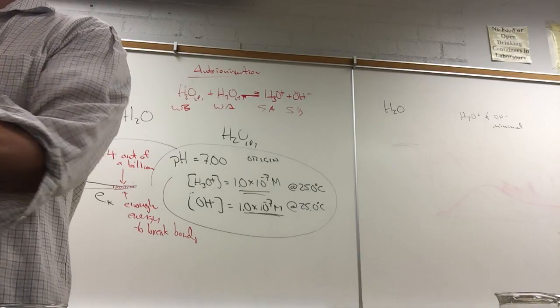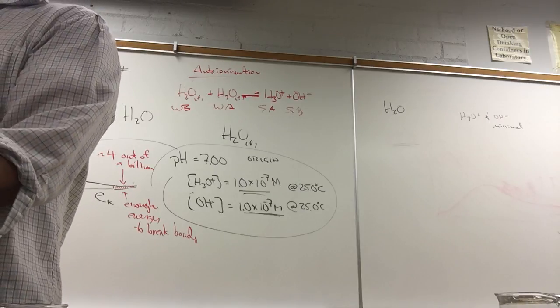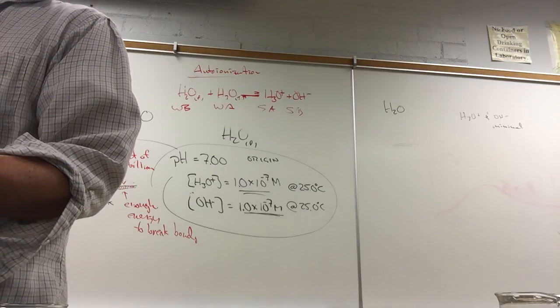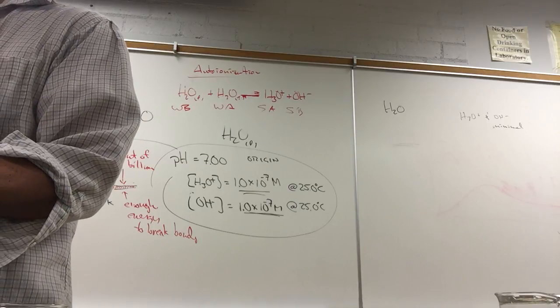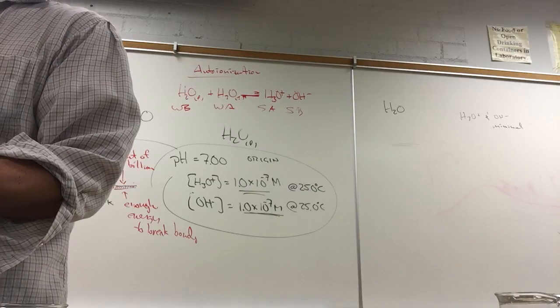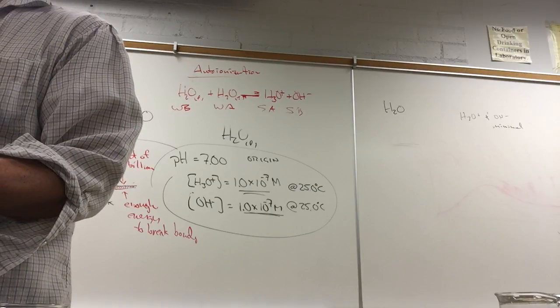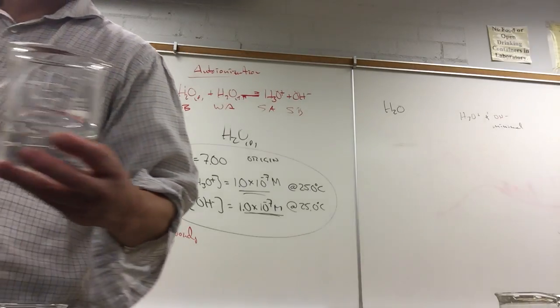This is tap water. Why does tap water conduct electricity? Minerals, yeah. Minerals, salts, that kind of stuff. It's just ions are present. What's next?